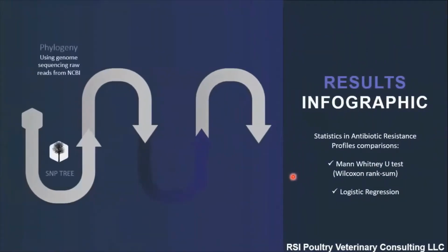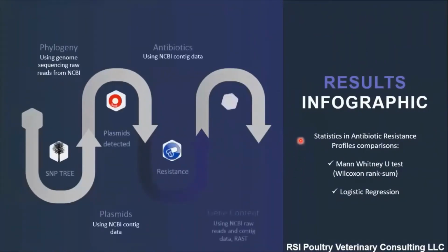In addition to the analysis mentioned, we ran statistics to compare the antibiotic resistance profiles. We utilized the Mann-Whitney U-test and logistic regression.